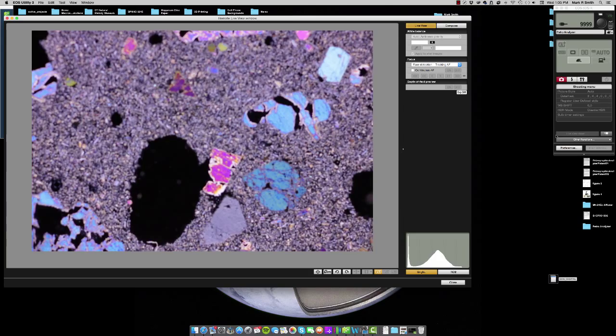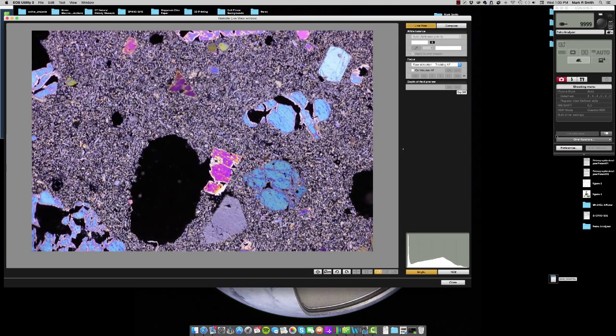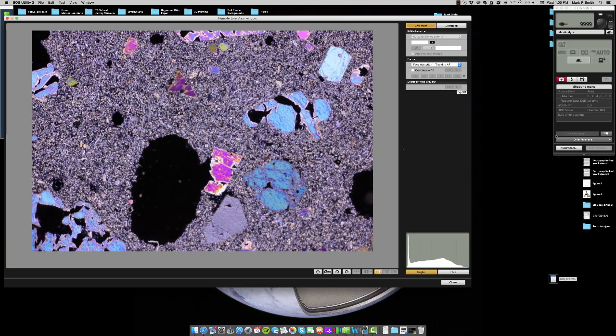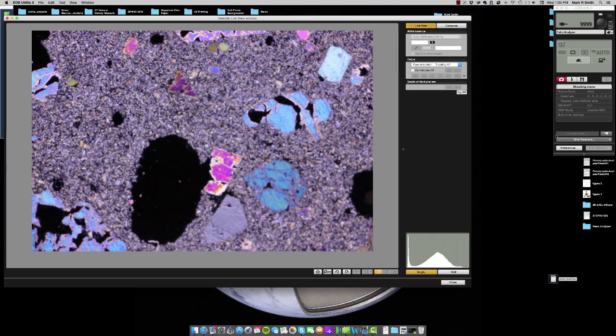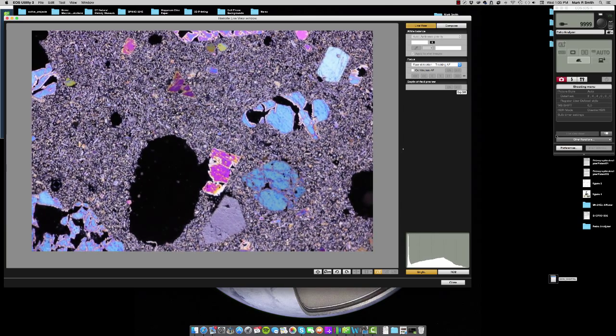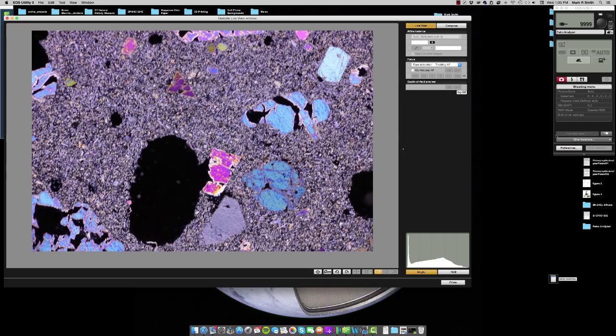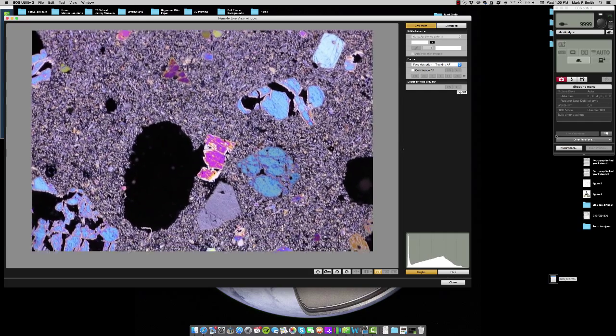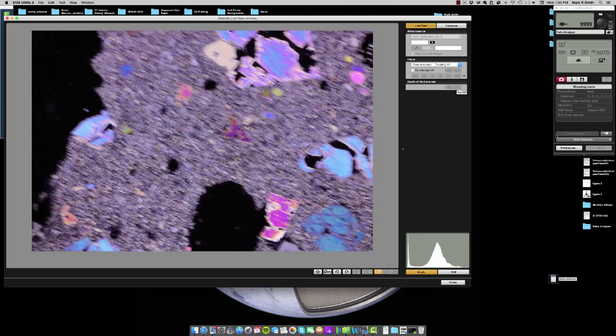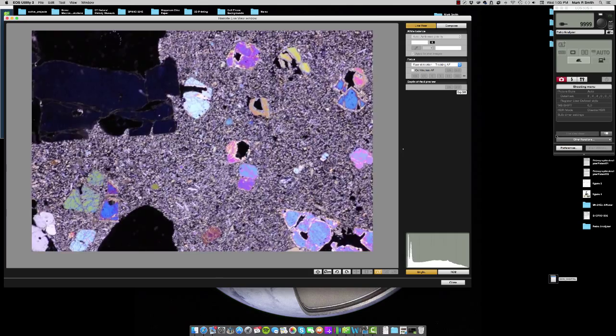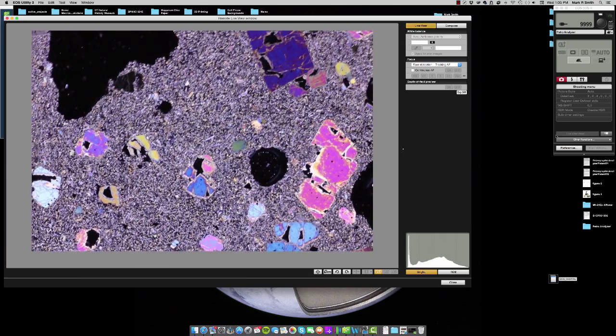But you can also observe everything in context. You never really lose where you are. I can just basically move the base to find my center of rotation and spin the stage to look at things such as pleochroism and document the extinction angles.